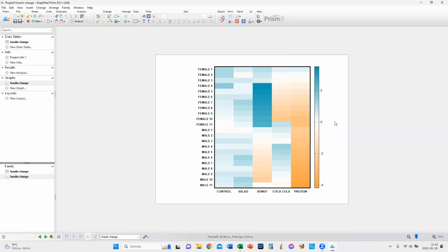The reason I told you that do not change to the full size of the graph to fill the page, because on the class we observed a problem that the way that you are changing these or these, somehow the program is just saying, okay, I quit. And then you can go back and you need to start the whole editing process again. But if you are using this manual change, this is not going to happen. But take care of that.